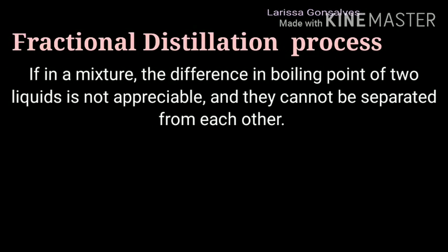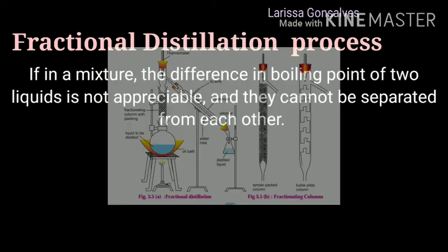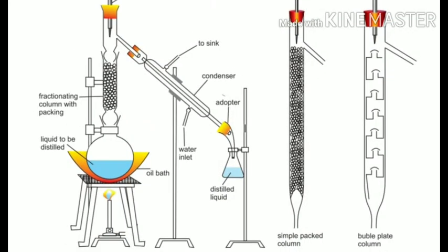Now, we move on to study fractional distillation. When you take a mixture of two liquids and there is no appreciable difference in their boiling points, then we use the fractional distillation process. Here is the assembly which is used for fractional distillation process.